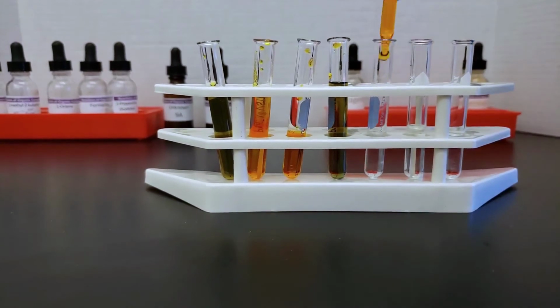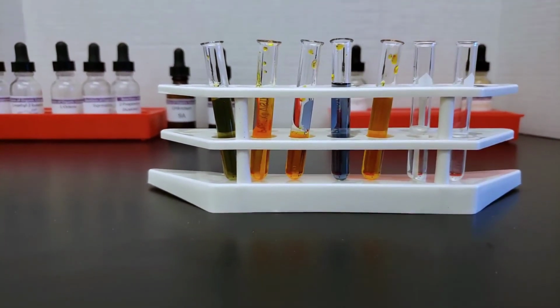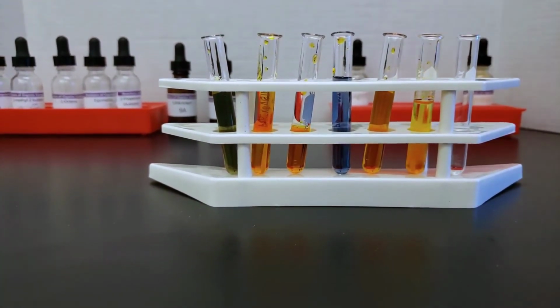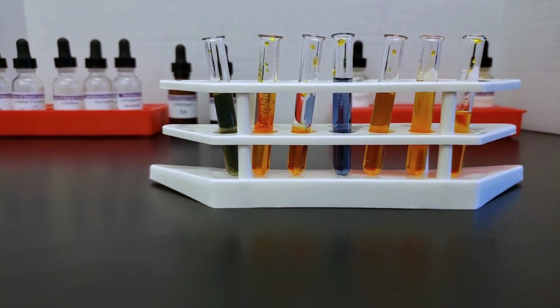So we have a definite, pretty quick color change with tube 1 and 4. Tube 1 is ethanol again. Tube 4 is formaldehyde. Tube 5 is acetone.